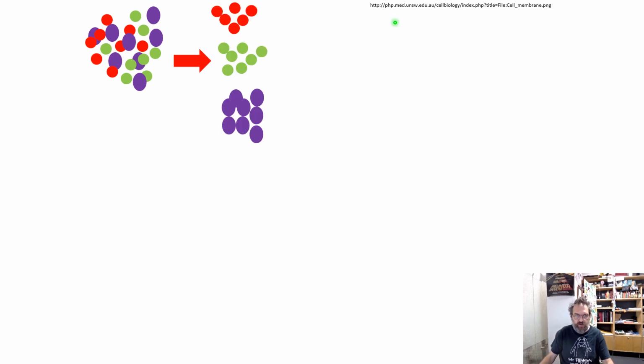Again we're representing the protein molecules by these balls. Each one of these balls represents different molecules of the same proteoform. Unless they can be floating around in liquid, you can't really separate them from other proteoforms. There's no way of getting them apart. So you need to separate the proteoforms away from other proteoforms to reduce the complexity of the sample so that as many proteoforms as possible are being identified and quantified.